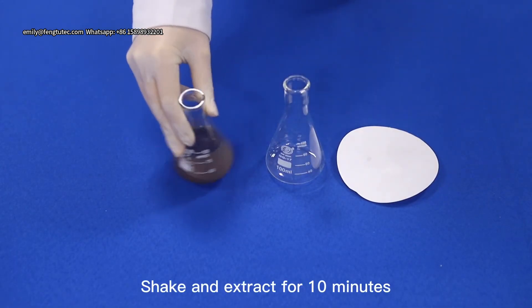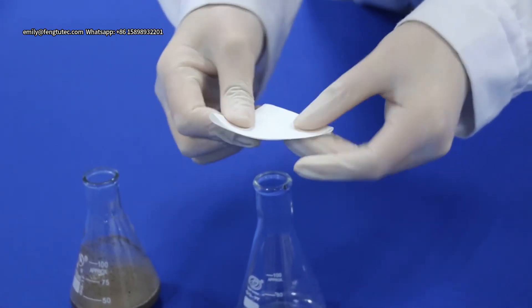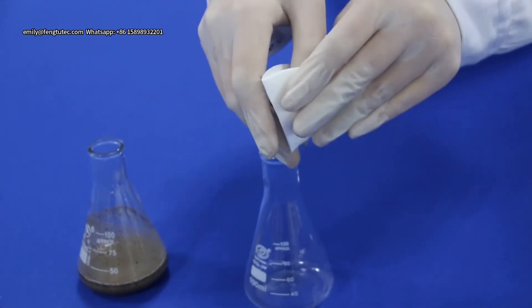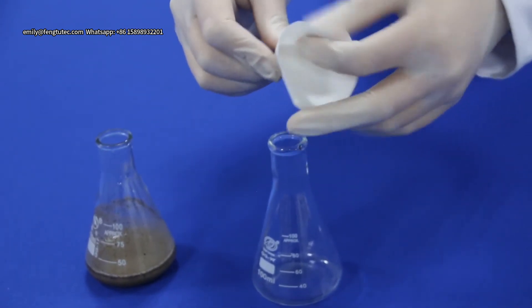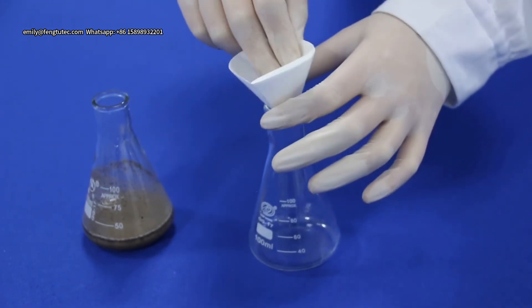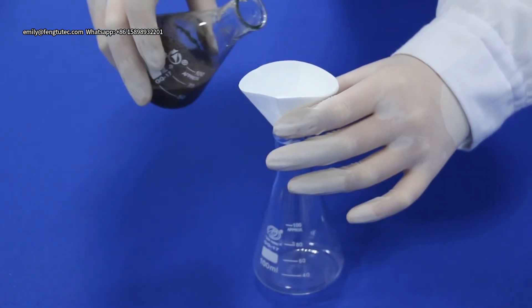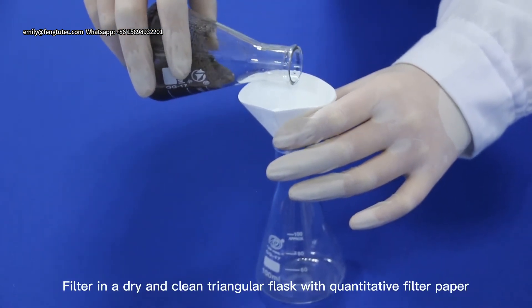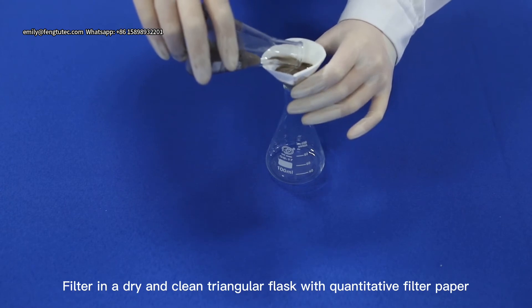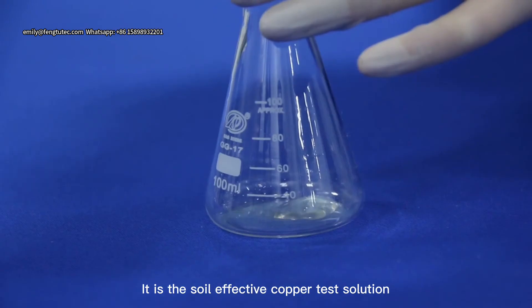Shake and extract for 10 minutes. Filter through dry and clean quantitative filter paper to obtain the soil effective copper test solution.